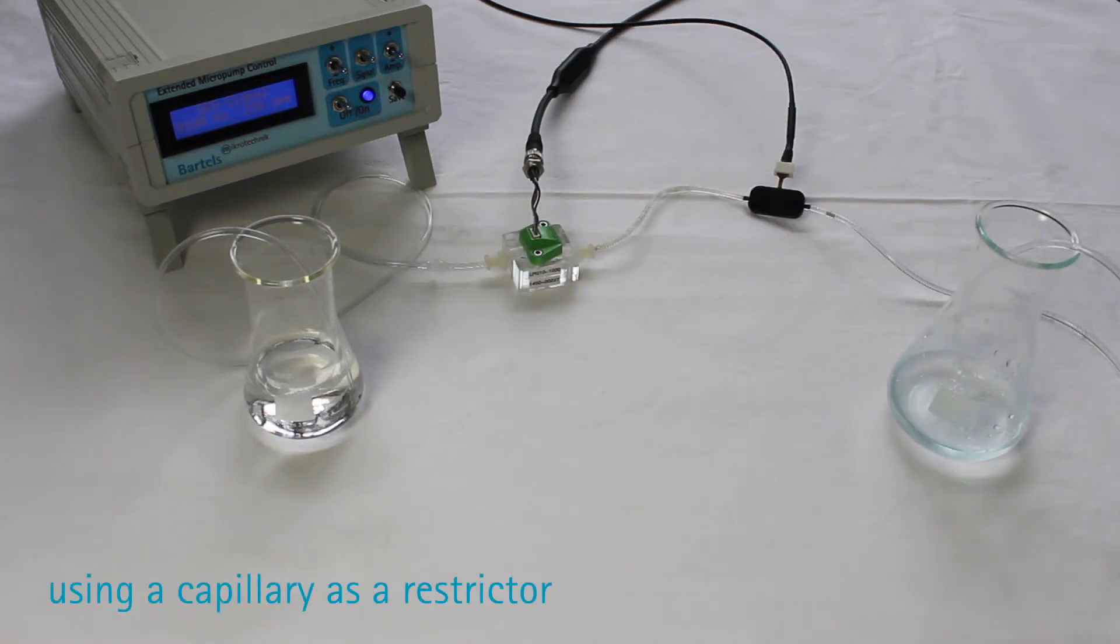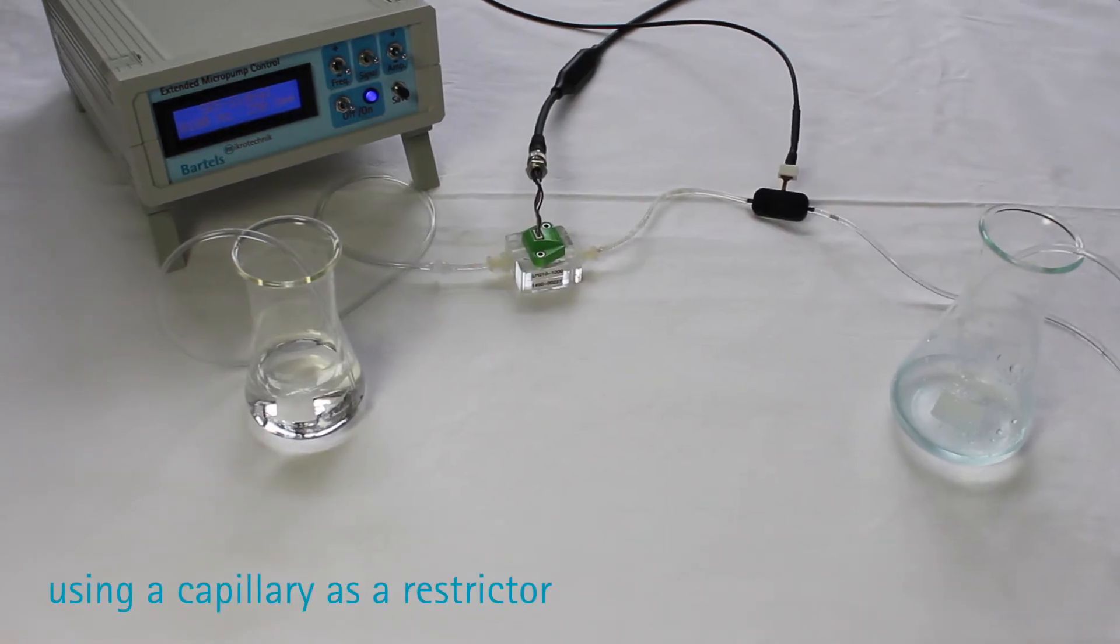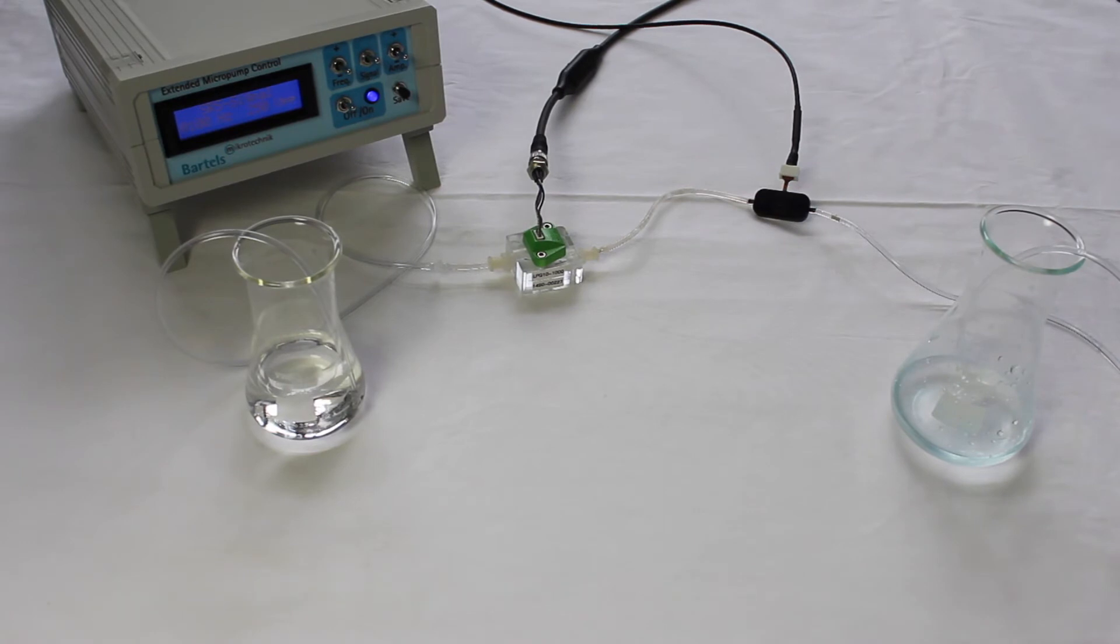This tutorial concentrates on using a capillary as a restrictor as it allows adjustment to a desired flow rate by changing its length.